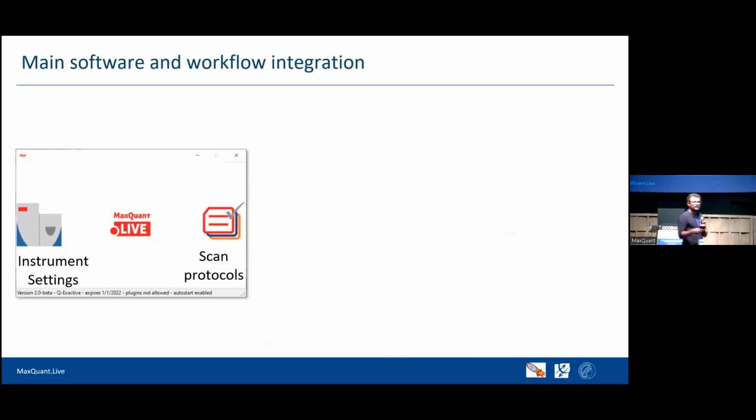There are some instrument settings which you can define, but you don't have to, and there are not many at all. There is a main window which gives you information about the run: what is happening now, is it doing MS1, MS2, is it finding peptides or not? And then there are the scan protocols, which is the most interesting part for you.